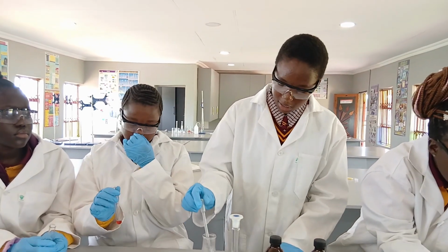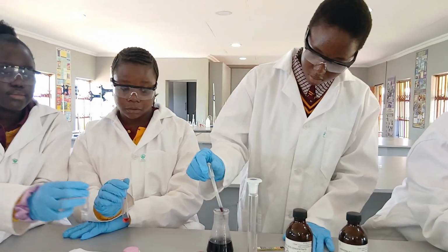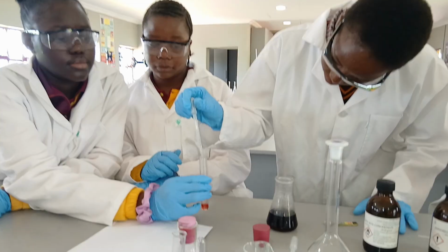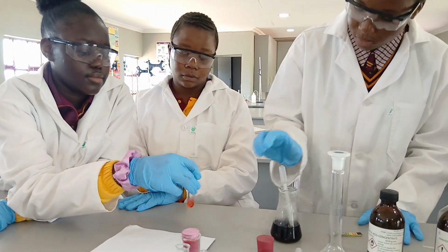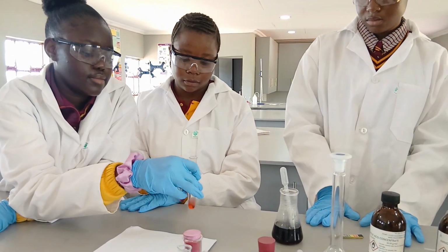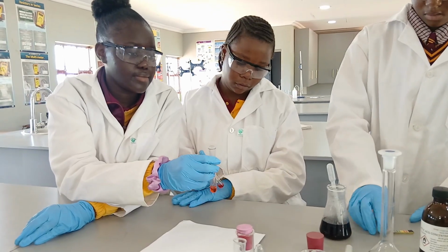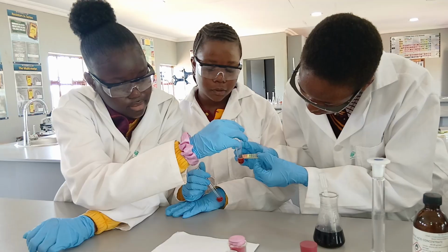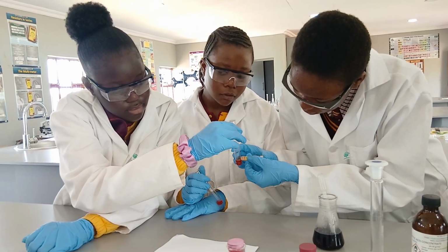So I'm going to check our last test tube. The pH is 1, which means this is an acid.